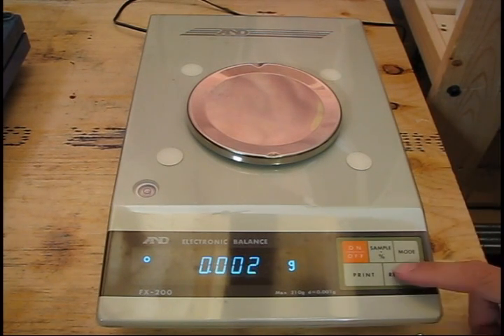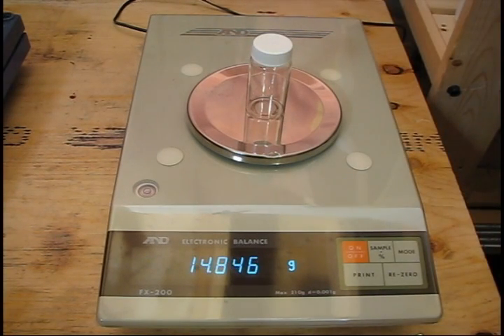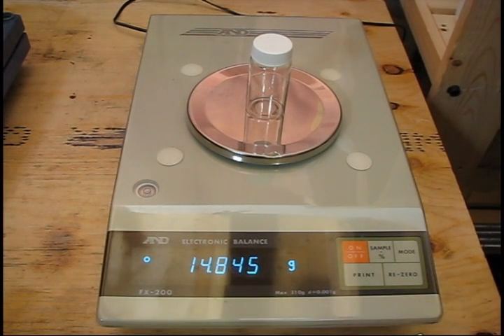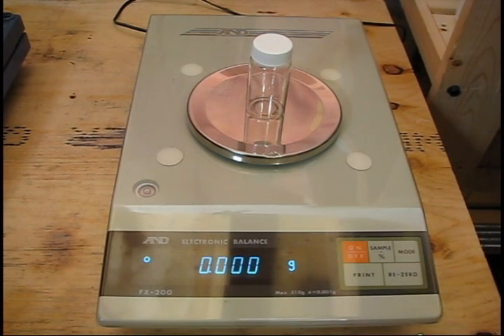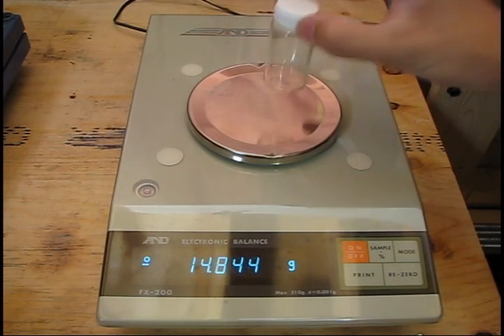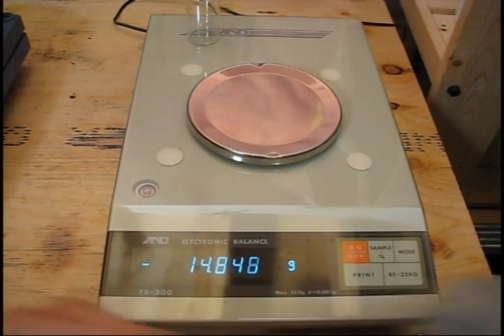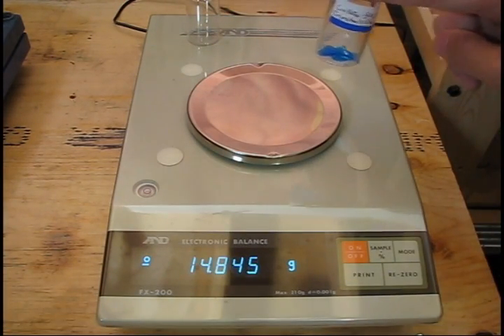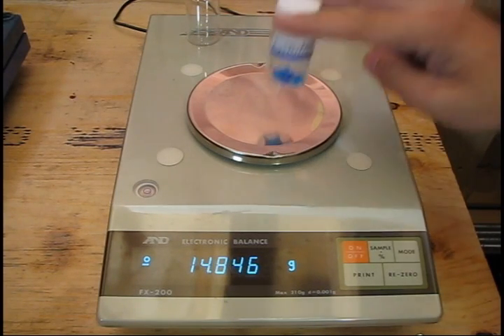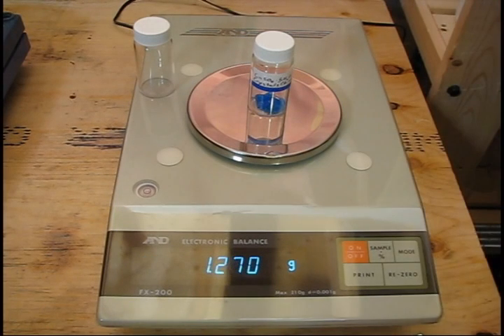To use the tare function: start with an empty balance and make sure it's zeroed. Place an empty vial on the balance and wait for it to stabilize. Once it's stabilized, re-zero it. The balance now is taking into account the mass of this vial — anything added to it, including labels, moisture, or the actual sample itself, will be measured, but not the vial mass. I'm going to cheat and use this pre-prepared vial; the mass of the vial will be different but it will illustrate the concept. Say you obtained some sample from a reaction and you've weighed this vial and zeroed the scale.